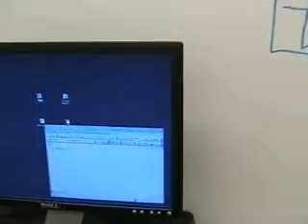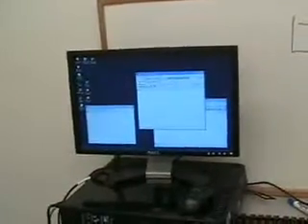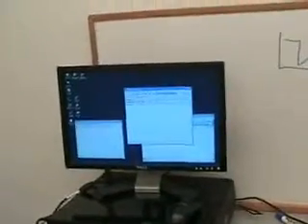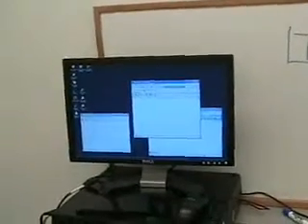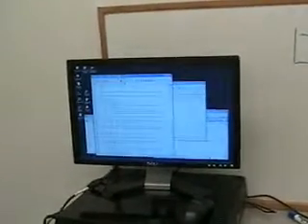So the next thing that you want to do is click on the MATLAB FRAP icon, and now MATLAB's going to take a little while to load, so we'll give it a moment to do that here. So MATLAB has sort of begun loading, but even after the first few windows pop up, you want to wait because there's one more yet to come, and that will be the script window, which just popped up there.